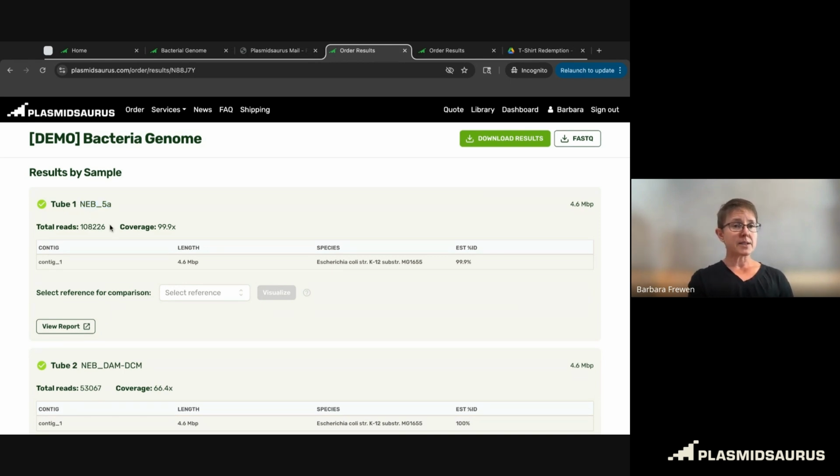So in the past, this has kind of been the extent of what you get. You have a list of your samples, it worked or it didn't, and you have this nice button that lets you dive into the results. So what we've added in the last couple of weeks is this additional summary information about each sample. So very quickly, you can see how many total reads we got, what's the depth coverage, and what's the length of the total assembly.